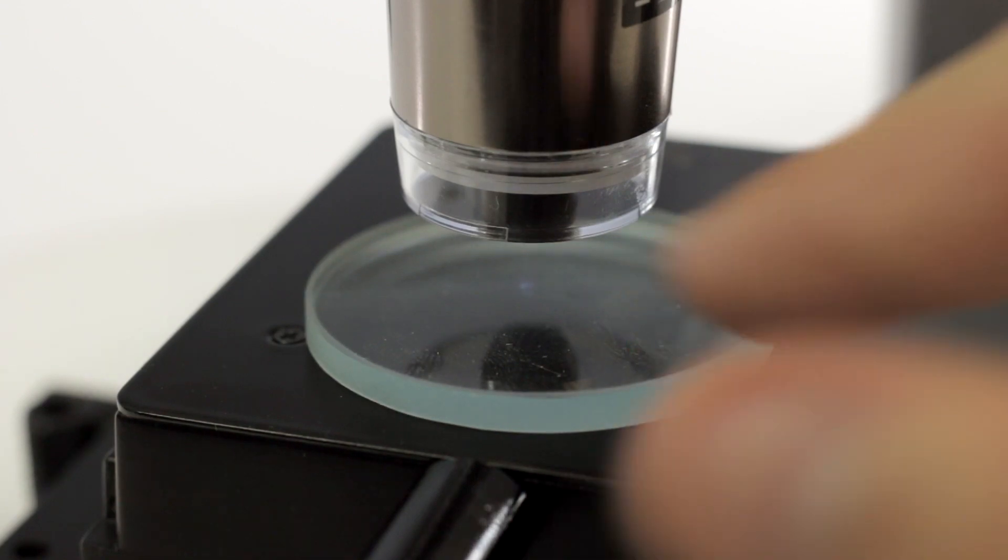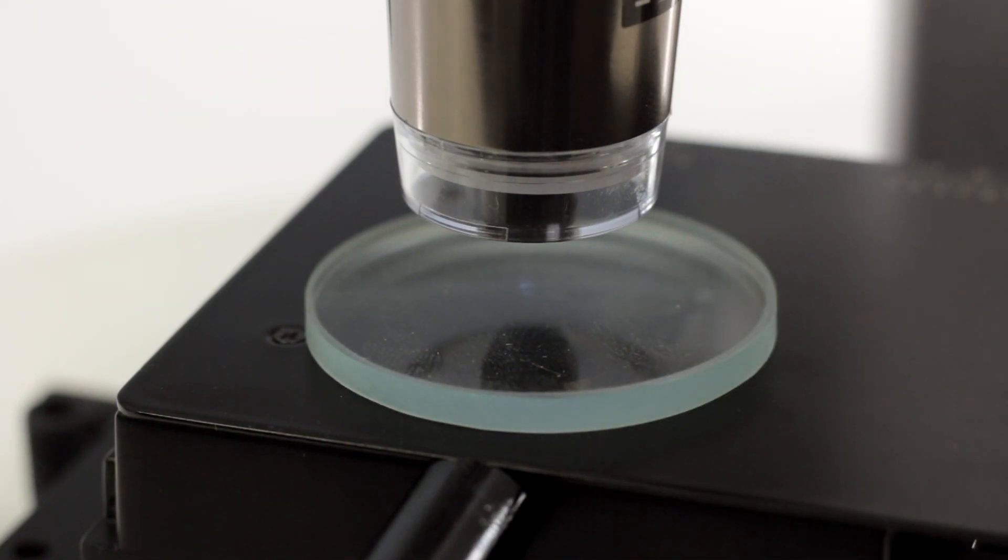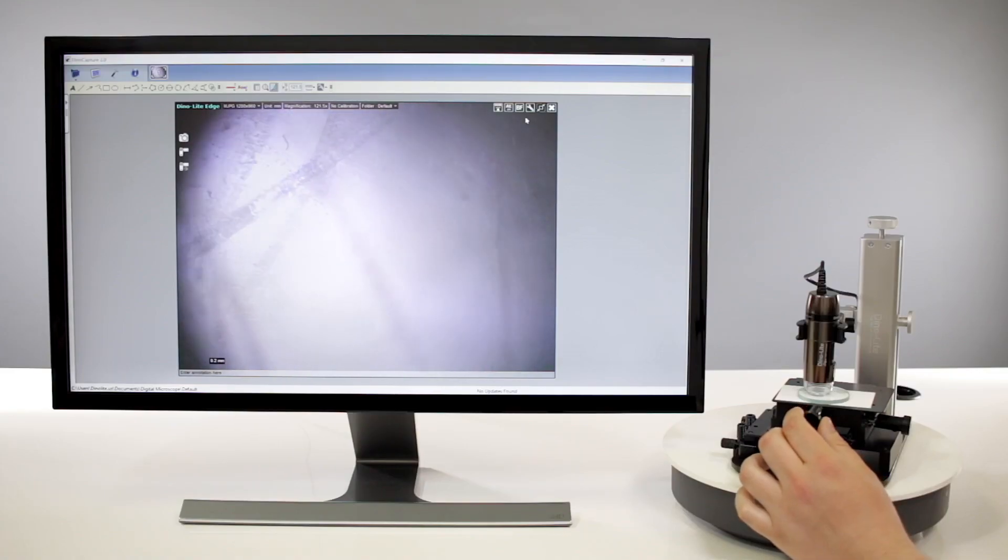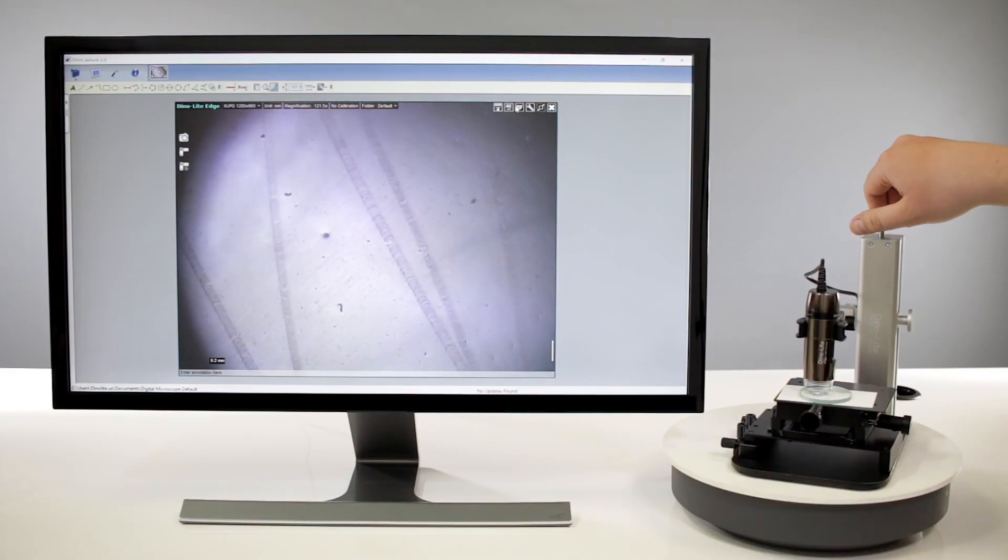Micro-scratches and other tiny details on hard-to-view surfaces such as glass lenses can be viewed with these models.